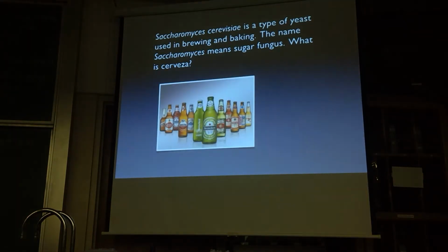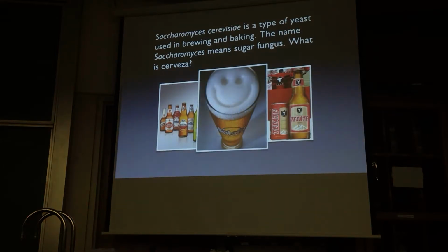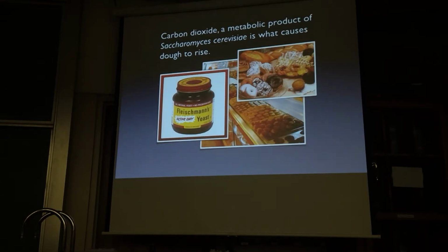So here's our prepared slide, we'll get to that. This is talking about what Saccharomyces is used for. Saccharomyces cerevisiae. Saccharomyces means sugar fungus, and cerevisiae refers to cerveza, and that's beer. So this is the sugar fungus used to make beer, or bread, same fungus.